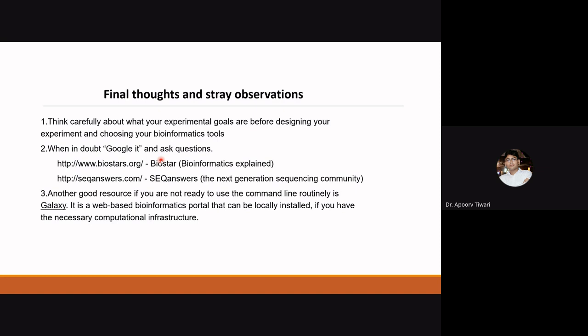And if you are analyzing novel plants and there is no reference genome available, then you can go for de novo analysis. For de novo analysis, we have suggested tools like Trinity and Velvet. So you can go for de novo analysis using those tools.